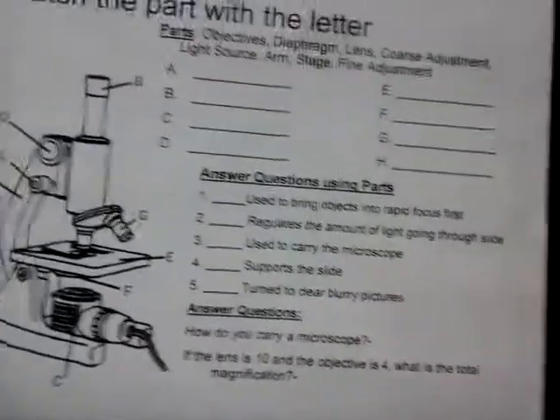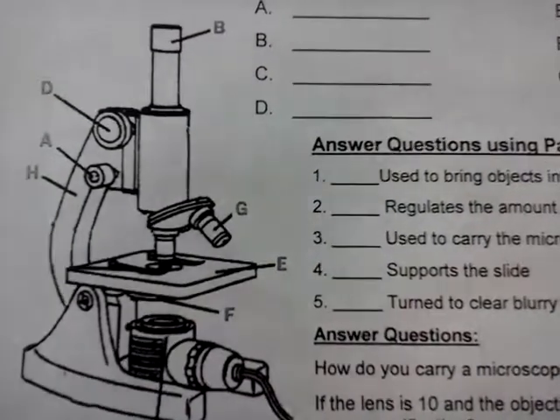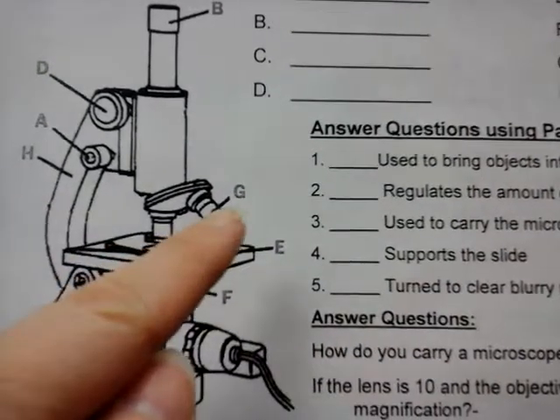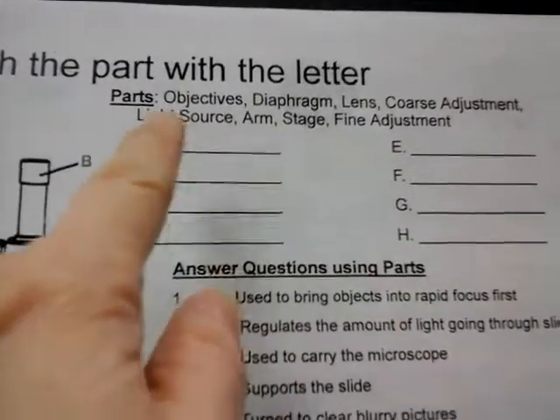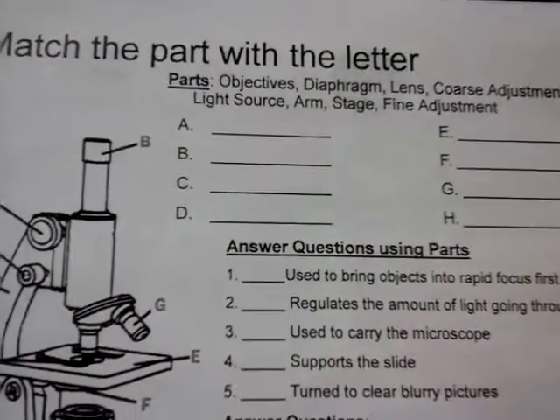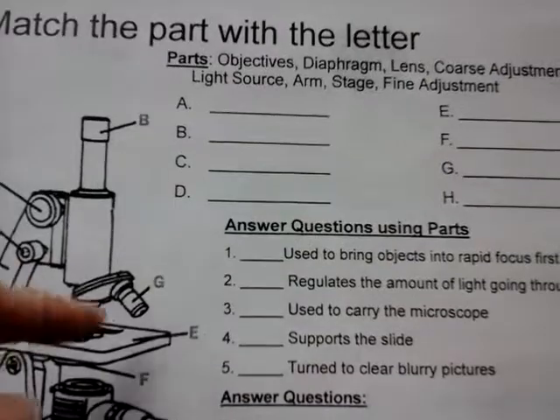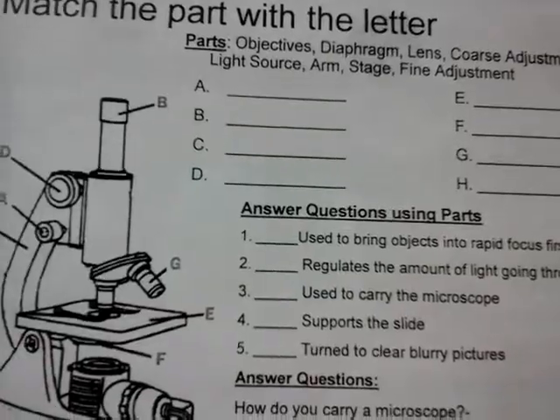Okay. Because when you get your microscope, you're going to see that the microscope has a stamp on it. And that stamp will say 10. There's a lens in here, and that lens by itself magnifies things 10 times. So if you were to take that off, you could use it as a magnifying glass. Now you also have lenses down here. And these lenses, letter G, are these things called objectives. Now, when you look through this eyepiece, you're going to magnify things 10 times no matter what. But depending on which objective you choose, you're going to magnify it even more.